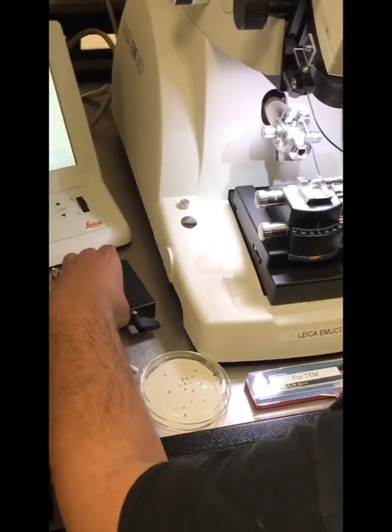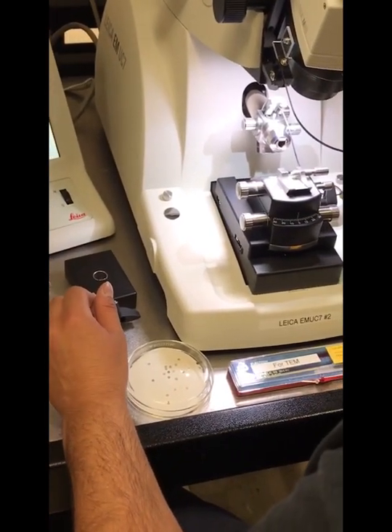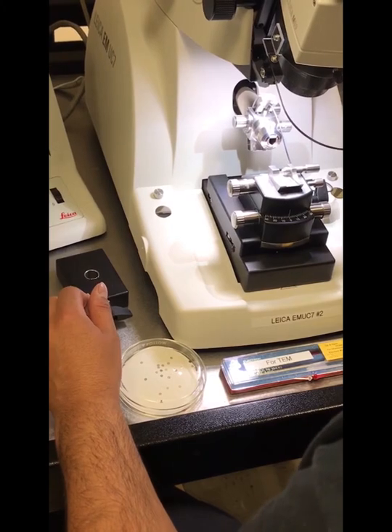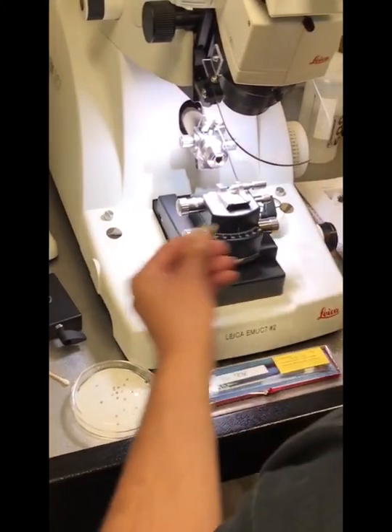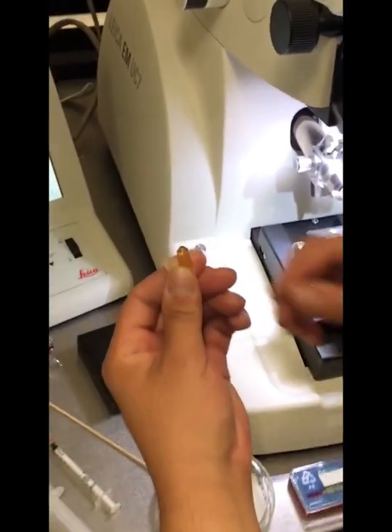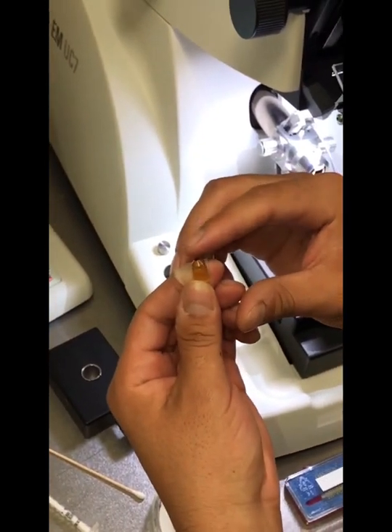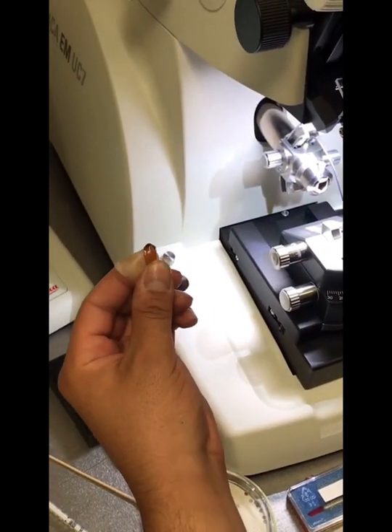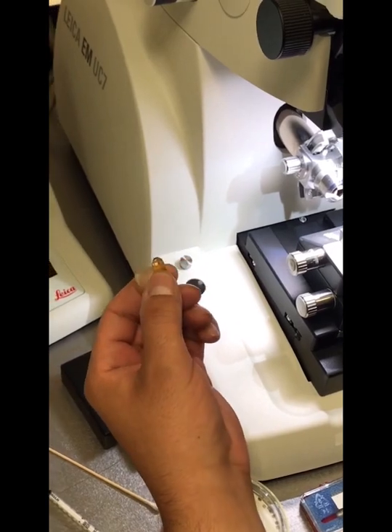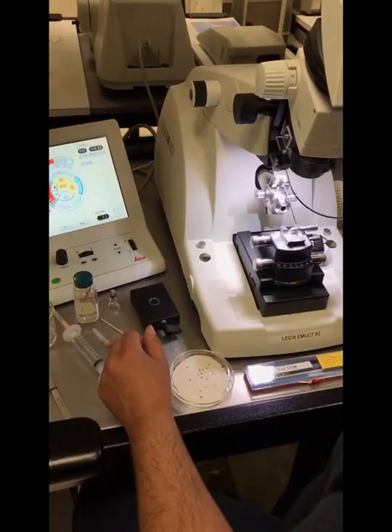Okay, so we're going to start trimming our block. We want our block from our resin block here to have a face that's one millimeter by one millimeter, and preferably in the shape of a trapezoid.